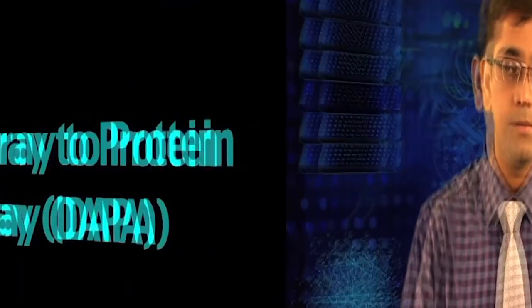In the DAPA approach, the investigators produced an array of double hexahistidine tag GFP, and data was found to be comparable with existing protein array technologies. With DAPA, it is possible to use the same DNA template repeatedly to print multiple protein arrays. It has been shown that one can use this template for printing almost 20 arrays. So, let me now show you the working principle of DAPA in this animation.